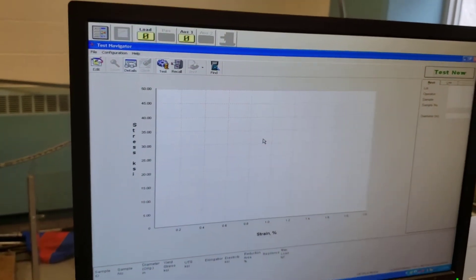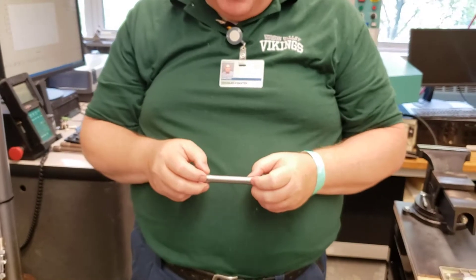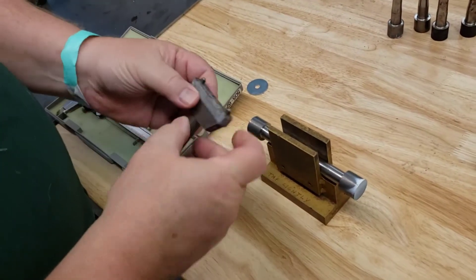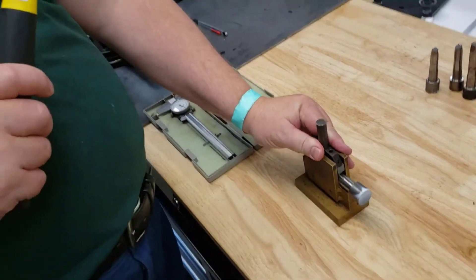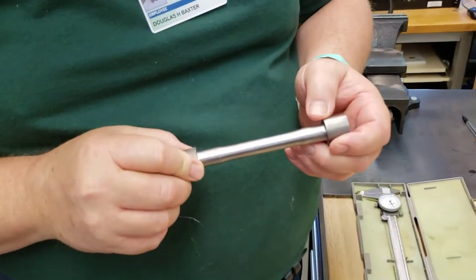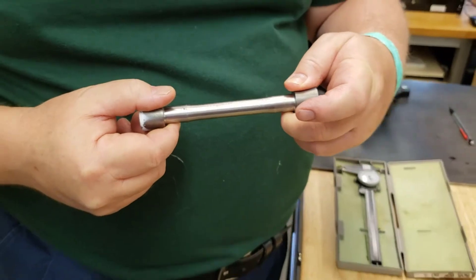The way this tester works is that we're going to use our test sample and gauge it first. We need to mark off the test length, which is two inches as you know from your manual. I need to indicate two inches across the test portion of the specimen, which is between the fillets. We set our sample in the stand, place the marker, and hold it gently. You do not hit this hard — give it a nice firm tap, a little gentler for plastics. You'll see two indents: that's the gauge length, two inches. That's important.